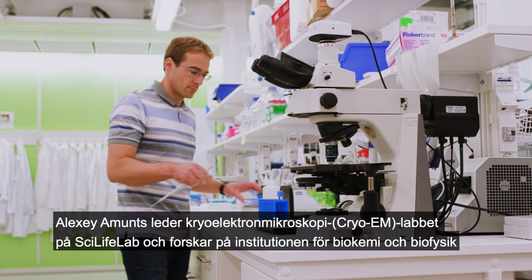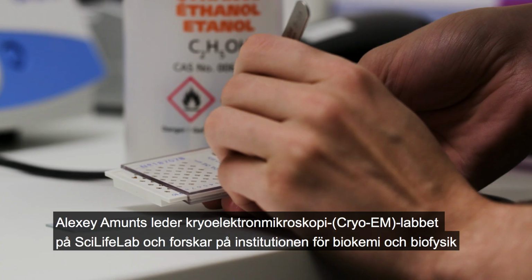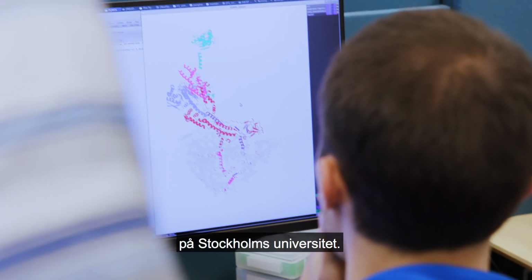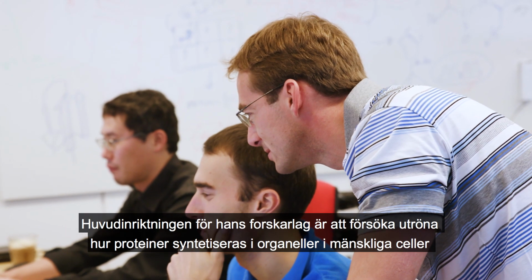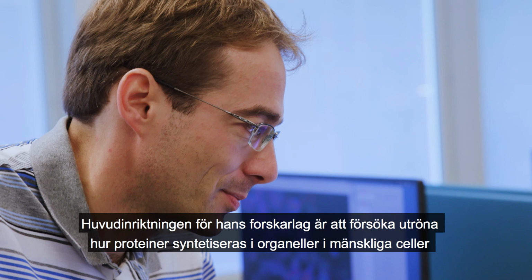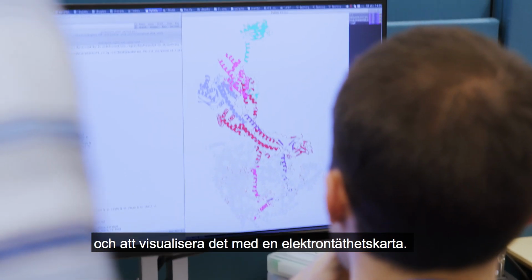Alexey Amunts is head of the cryo-EM laboratory at SciLifeLab and a scientist at the Department of Biochemistry and Biophysics at Stockholm University. The main focus of his team is on trying to find the answer to how proteins are synthesized in organelles in human cells and visualize them with an electron density map.